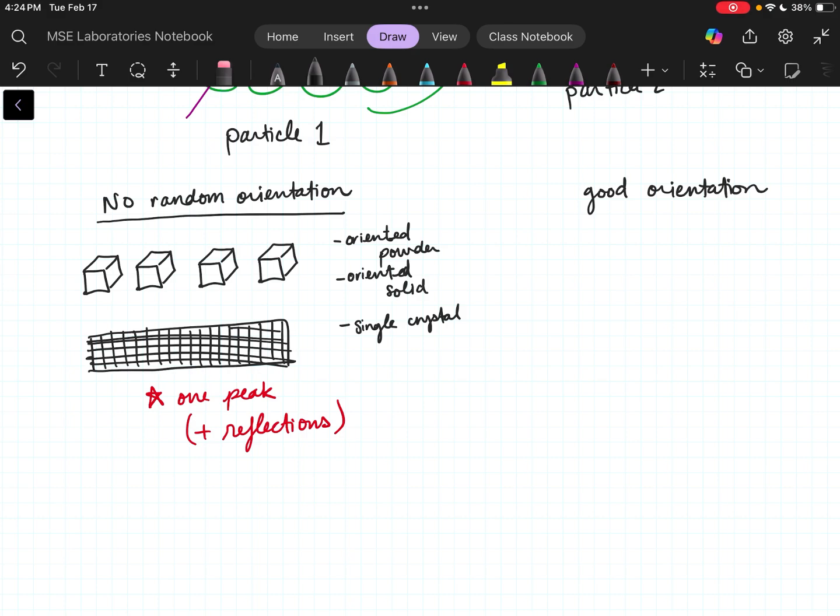There are plenty of ways to study those materials, but the Bragg-Brentano orientation, which is what we're talking about today, is not suited for these kind of materials. Other than maybe telling us the direction it's oriented. It's like, yeah, this is face up. And you're like, yeah, great, thanks. But you can't learn a lot about the other dimensions of the material. That would require rotating the material or maybe passing the x-rays through the material instead of bouncing them off.